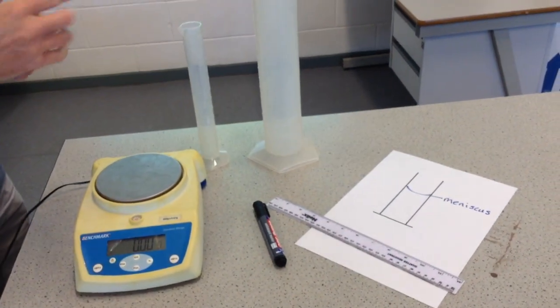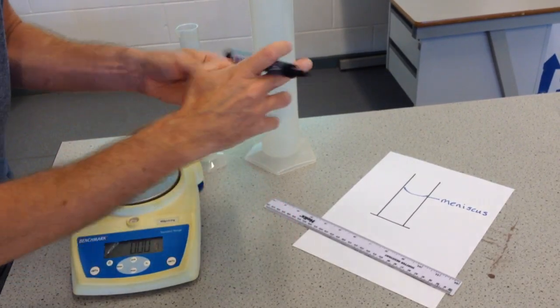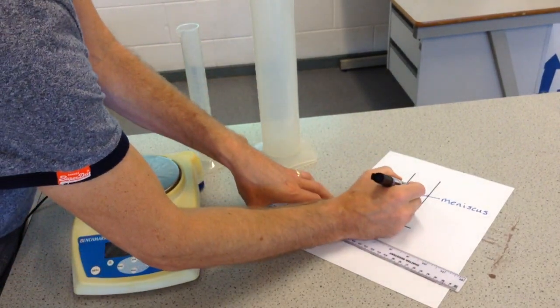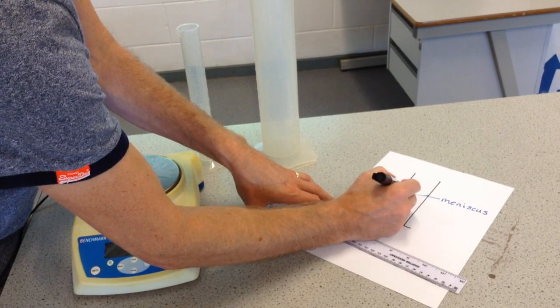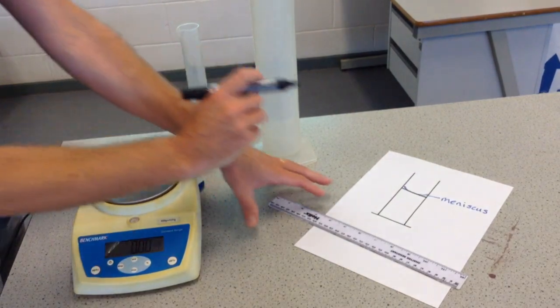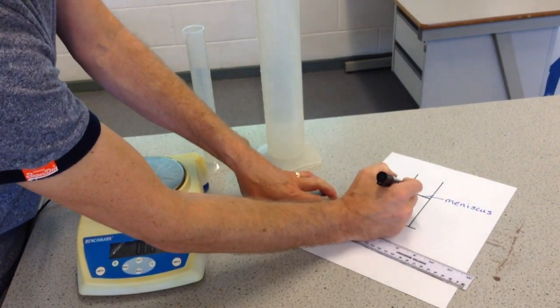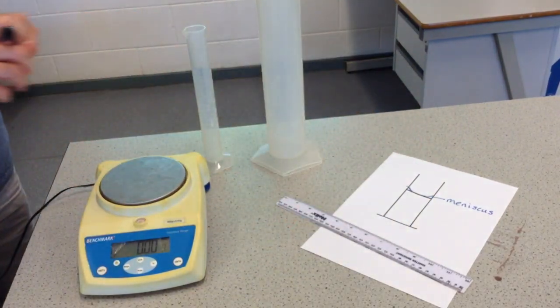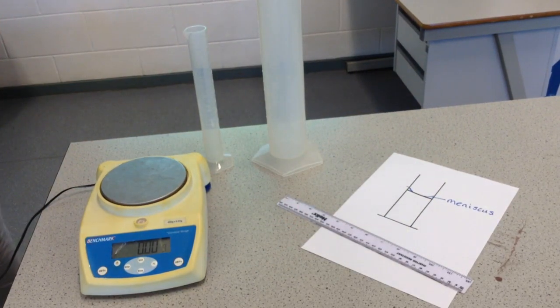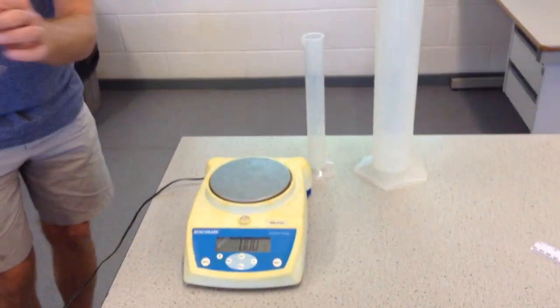Whenever we read the measuring cylinder, what we must try to do is make sure that we line our eyes up with the bottom of the meniscus — so I should be reading at that level there, not this bit here. I should be reading with the bottom of that meniscus curve. I'm happy that that is ten centimetres cubed.